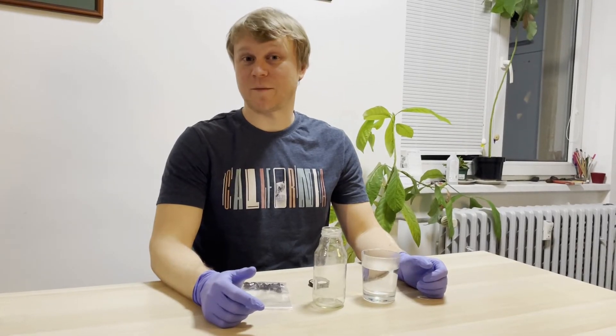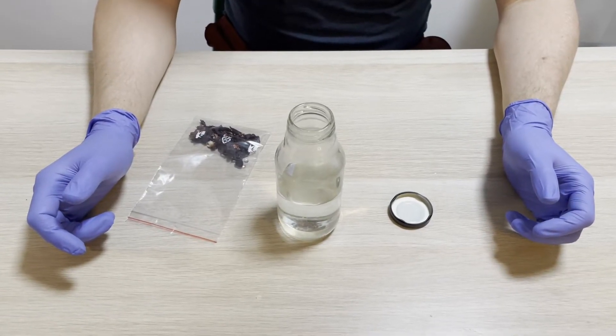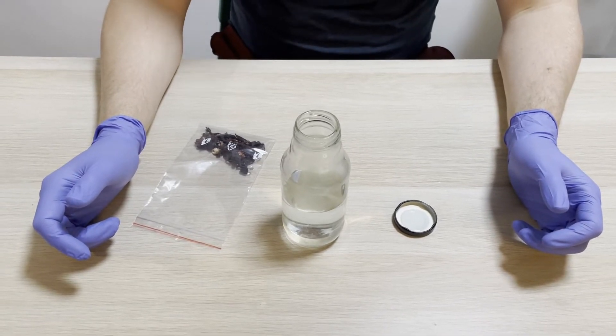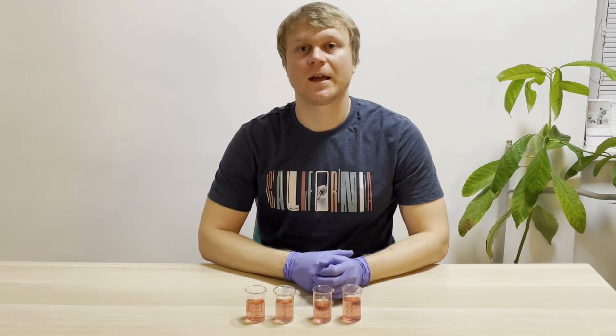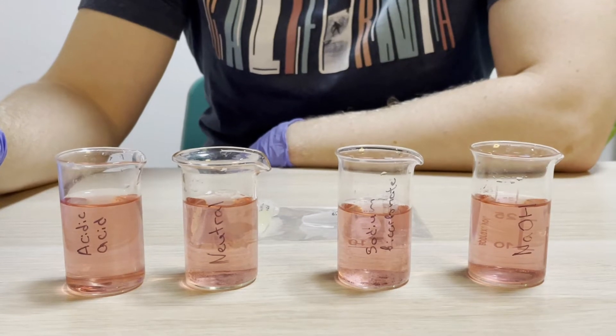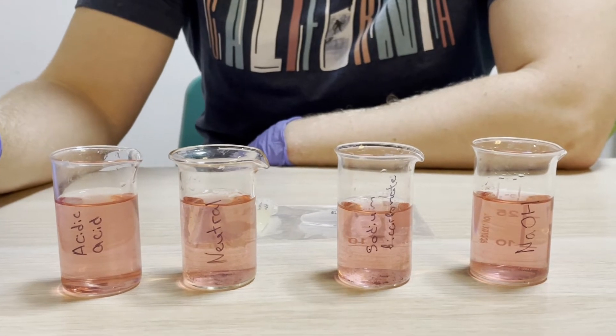Let's start the experiment. Brew some provided hibiscus tea leaves in the bottle with warm water for 5 minutes until it extracts the pigment. Next we will check the behavior of anthocyanins in solutions with different pH levels. We will add different reagents which change the pH of our reaction to acidic, mildly basic and very basic. Add several drops of vinegar to the first beaker and the pH of the solution will change to acidic.